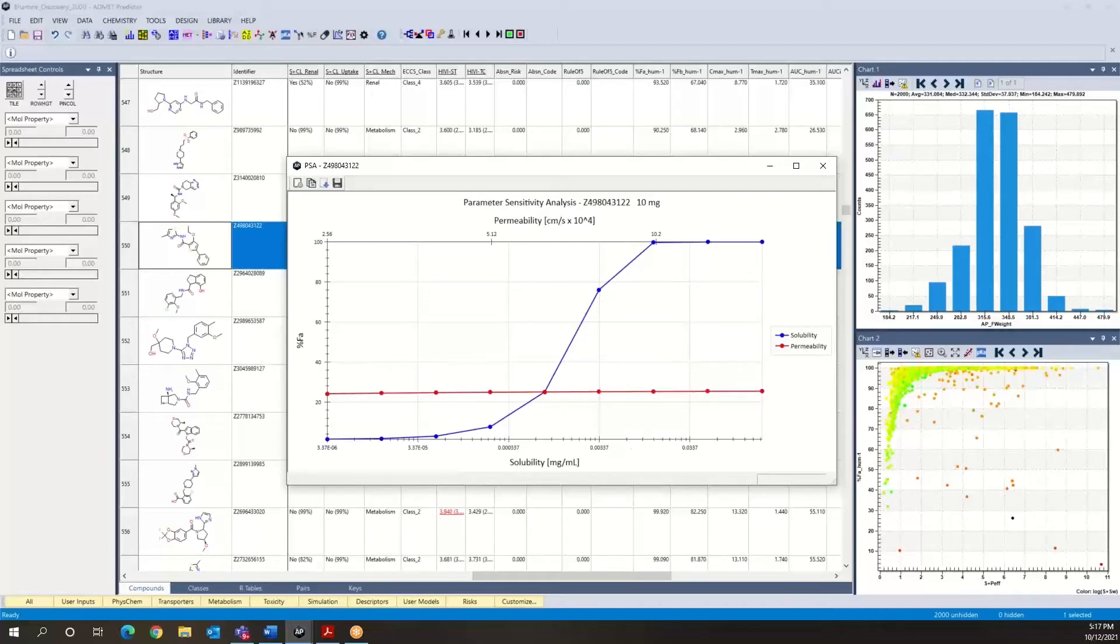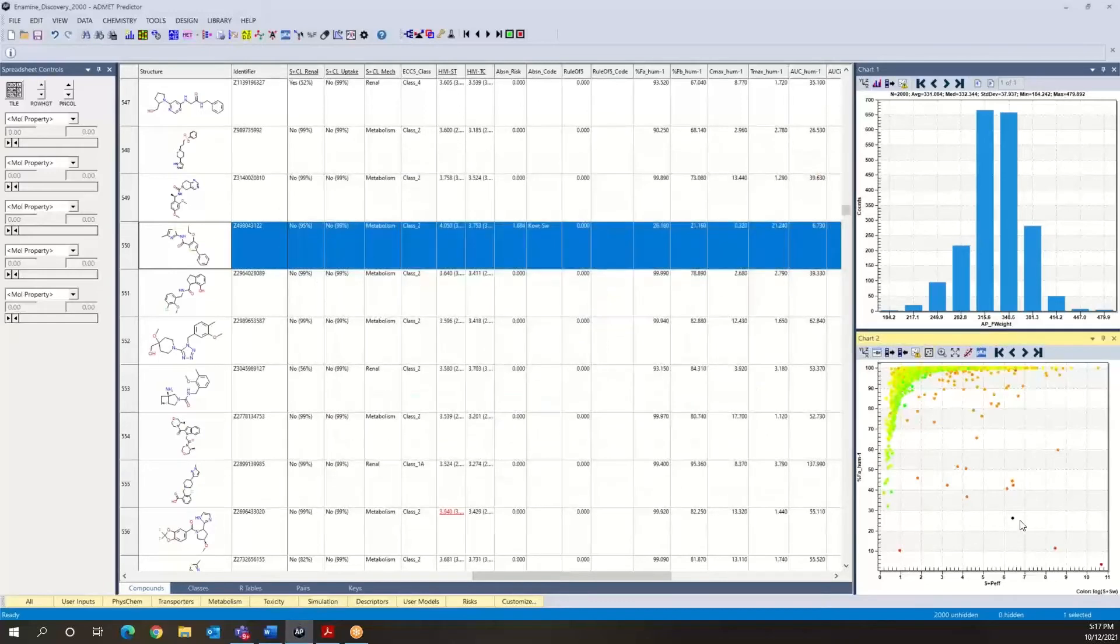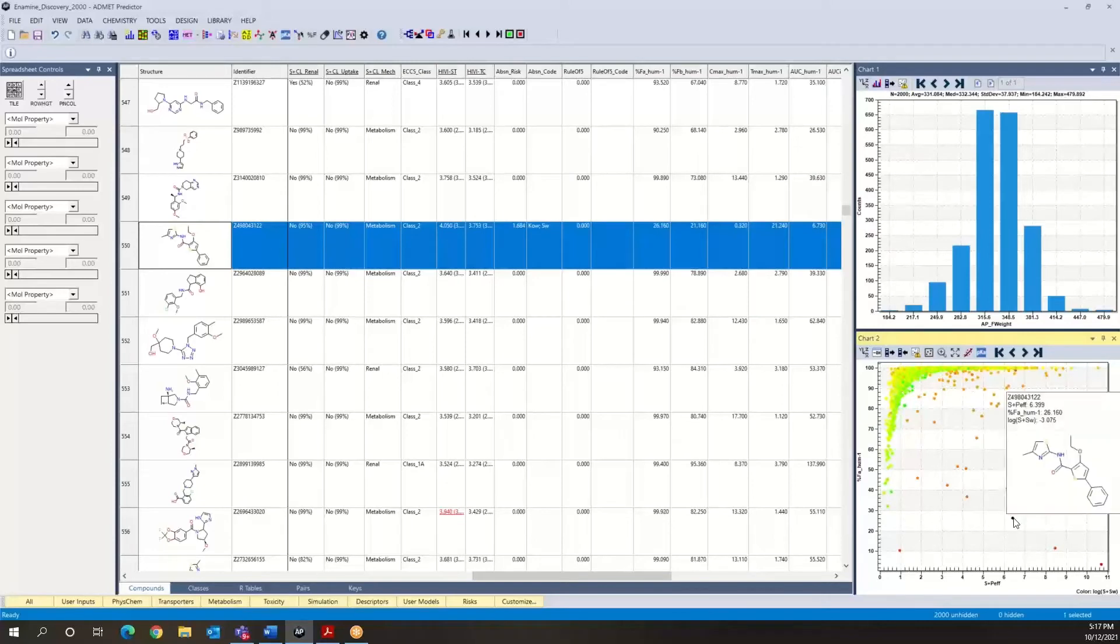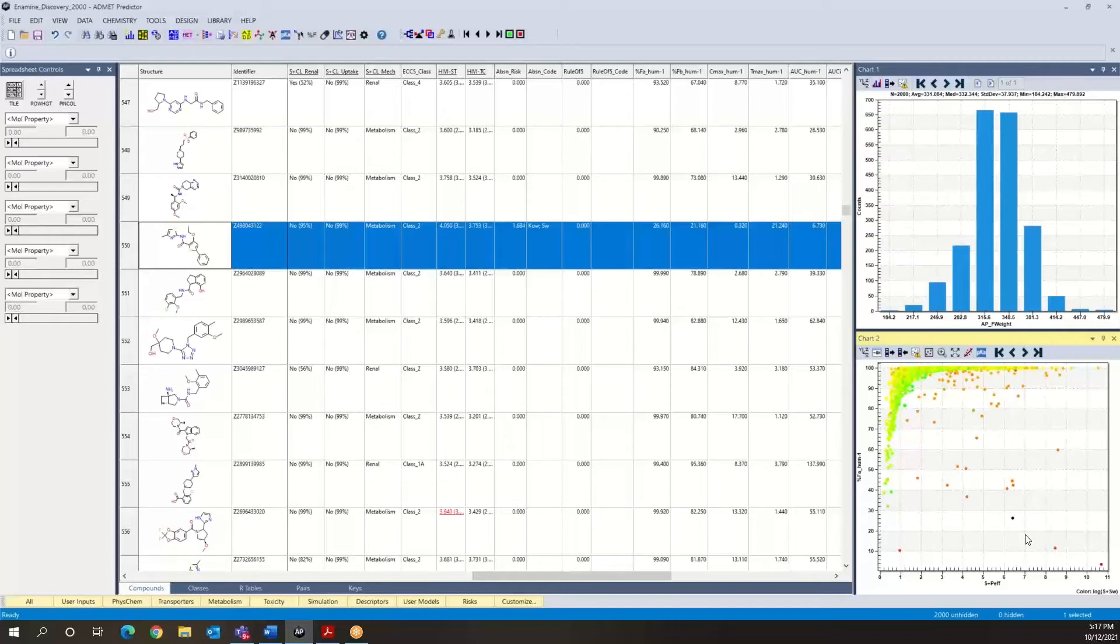So anyway, I hope that was a useful analysis. You can see how we can infer, even from this graph, what the projected behavior of the compound is likely to be. And with the parameter sensitivity analysis tool, we have the ability to investigate this at a much higher level of detail.